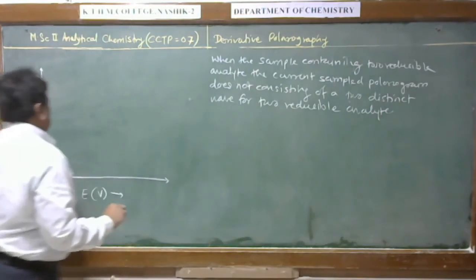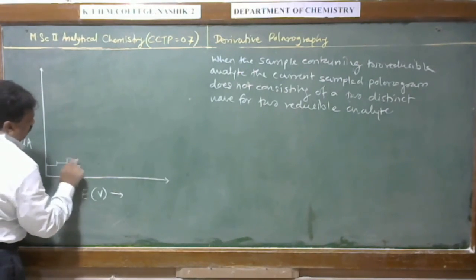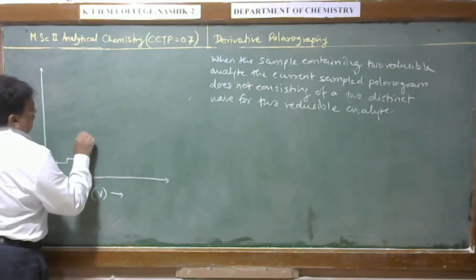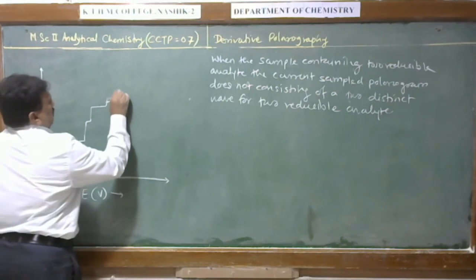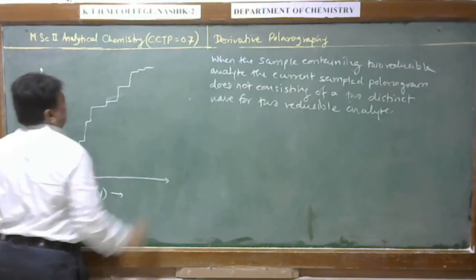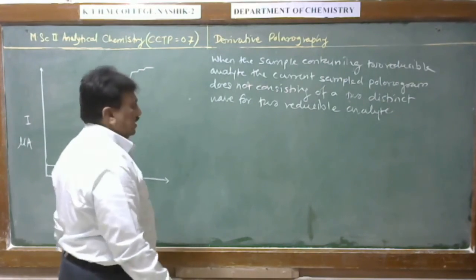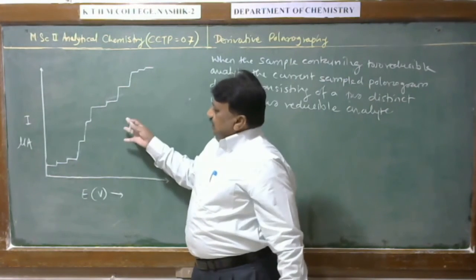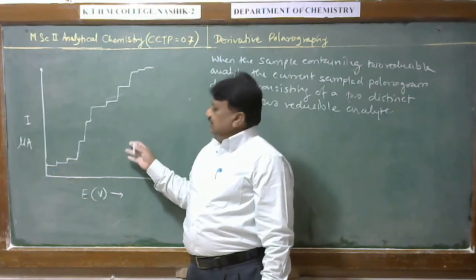That means the analytes are reduced and we have two waves on the polarogram, but these two waves are not obtained on this voltammogram, and it is difficult to determine the exact value of the cathodic current required for the determination of the analyte.